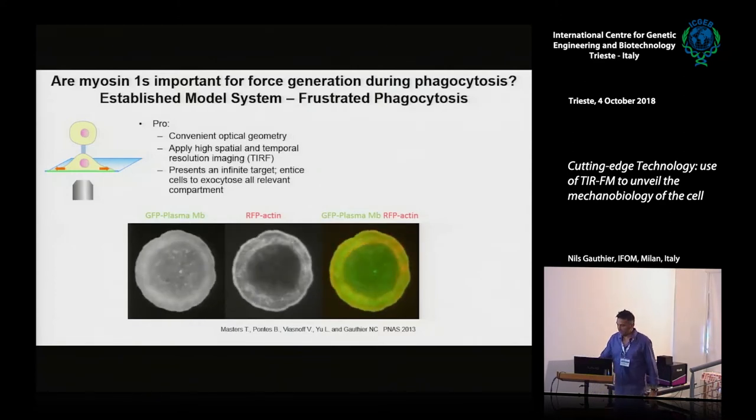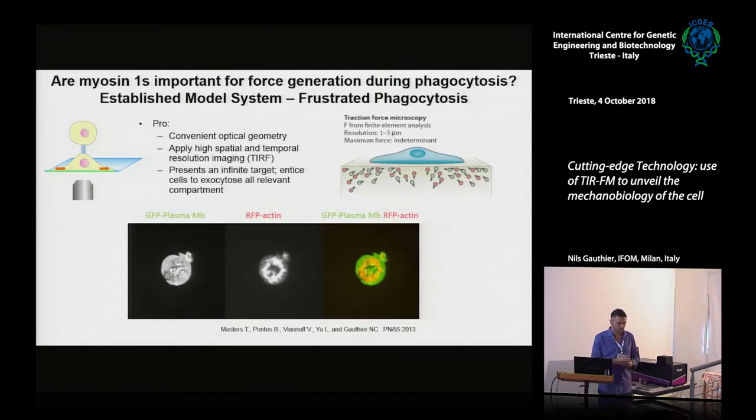Then we turn to the system, but with our question, and myosin, everybody knows actomyosin that makes forces. Then how do we deal with forces? Then we turn to this technique, which is also a microscopy derived technique, which is called traction force microscopy.